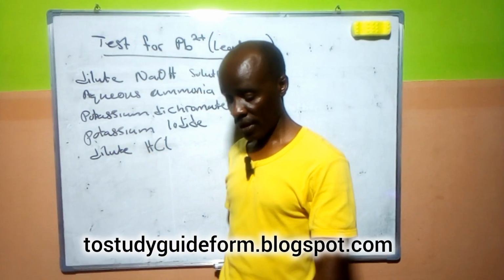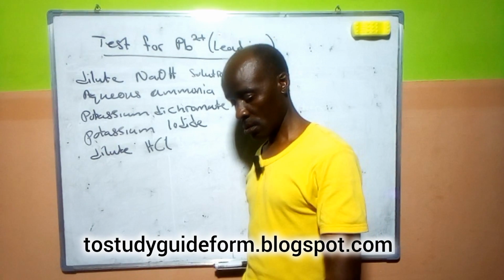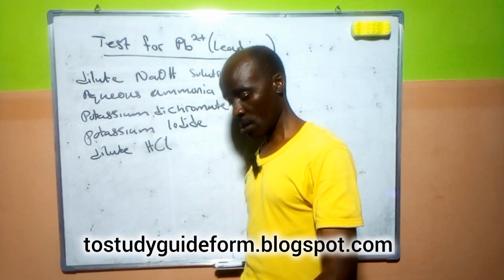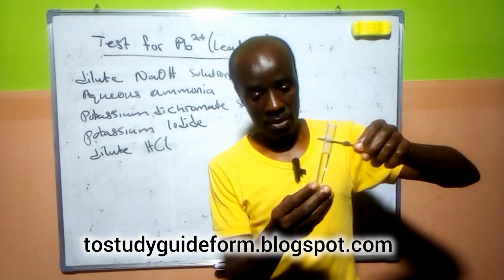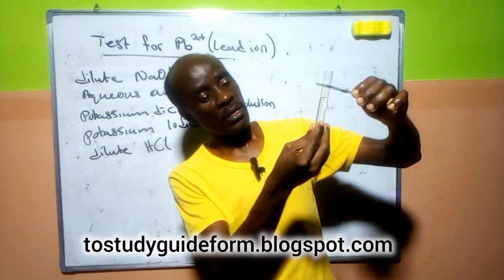How you can identify lead ion in a solution. Now we have a very clear solution. Now look at what will happen when we allow it to cool.